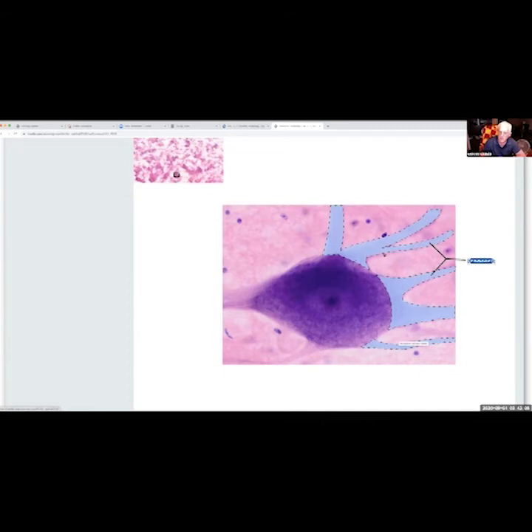What are all these little blue dots around it? Those are your neuroglial cells, like right here, right here, right here. These are supporting cells. Some of them are phagocytic cells. Some of them make the blood-brain barrier, which we're going to talk about. They isolate the neurons and protect the neuron cells. They make sheaths around it so it can conduct impulses quickly, called myelin sheaths. Those are all the support of the neuroglial cells.